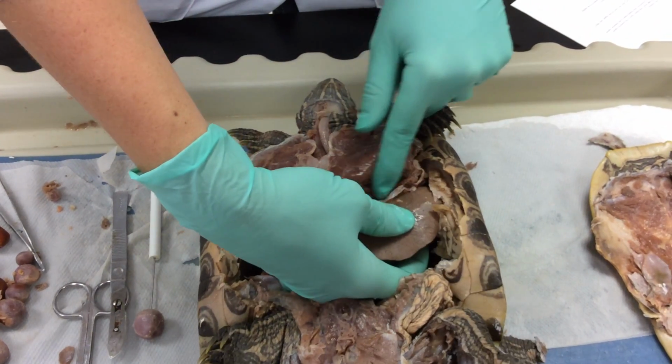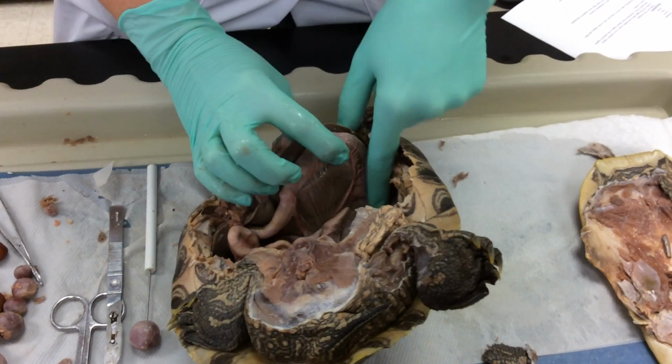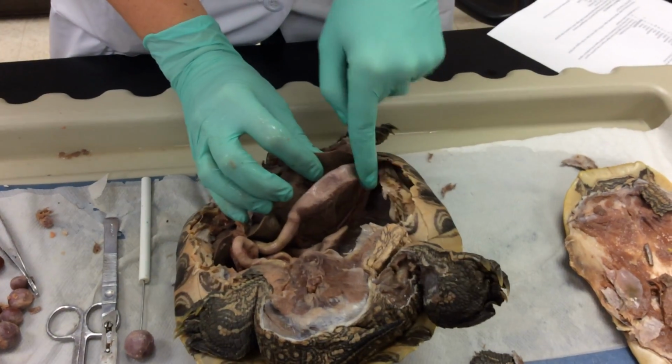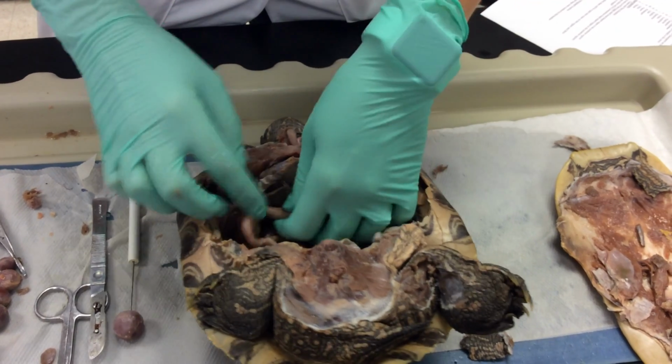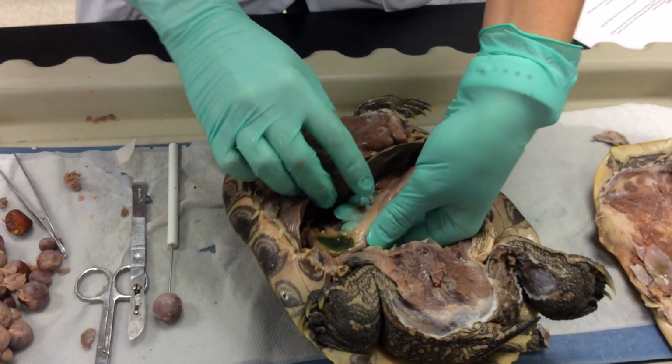It's going to travel behind this large structure, and this is the liver. As it goes behind this structure, you can see it right here. This is the stomach, all right? This huge section right here is the stomach. So the stomach leads into the duodenum, which is the first part of the small intestines, and that's this region right here.